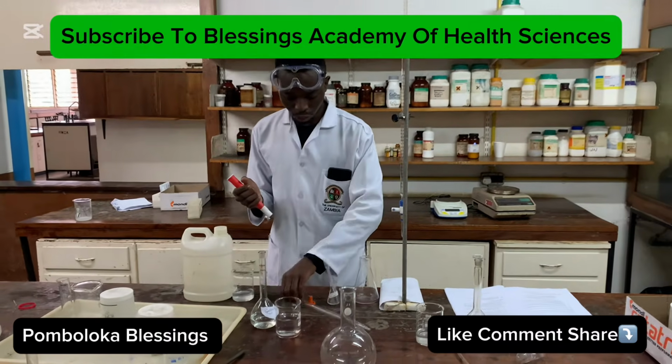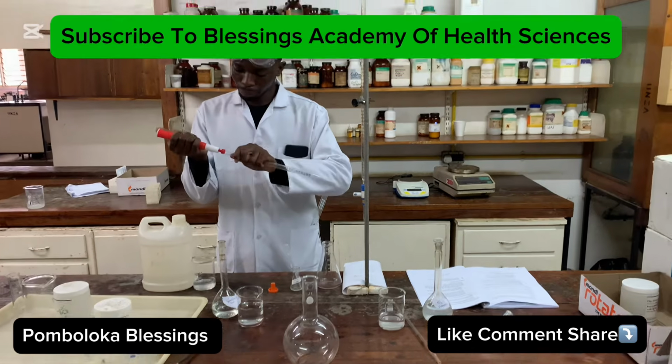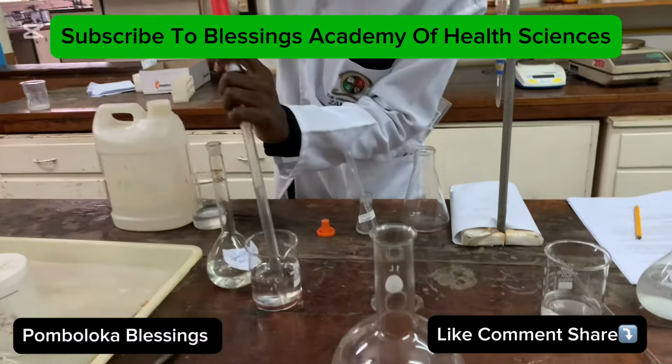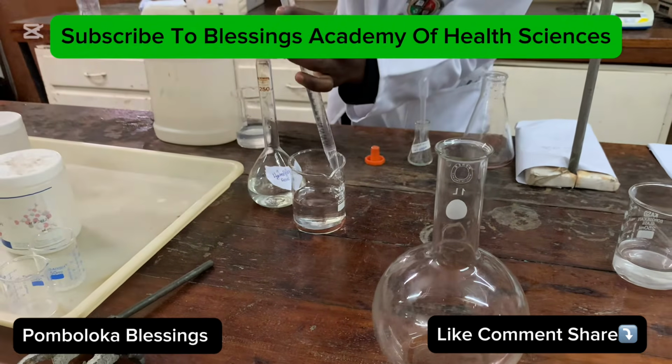And then 25 mLs of the HCl. So remember, it goes up to 25.